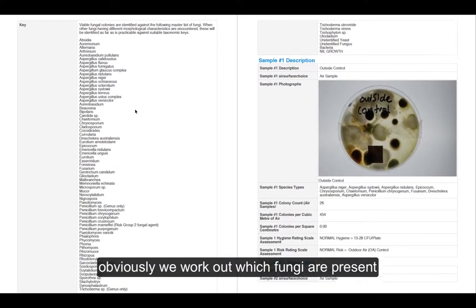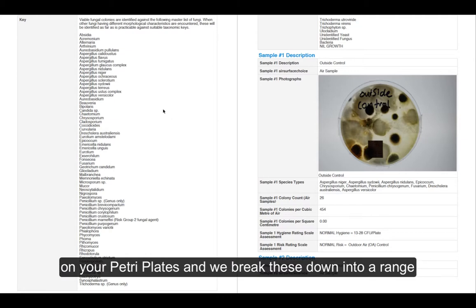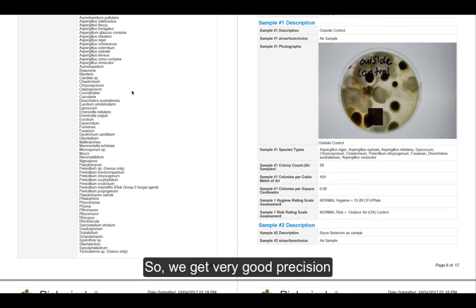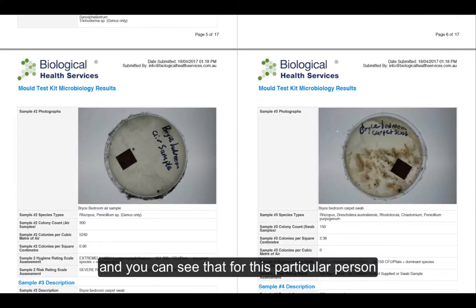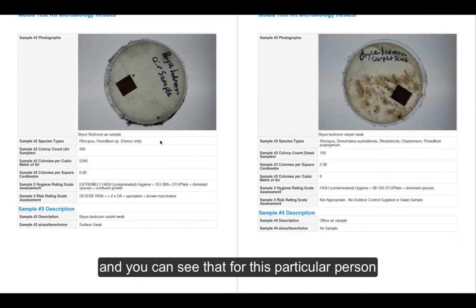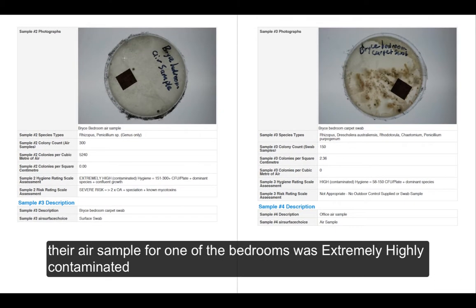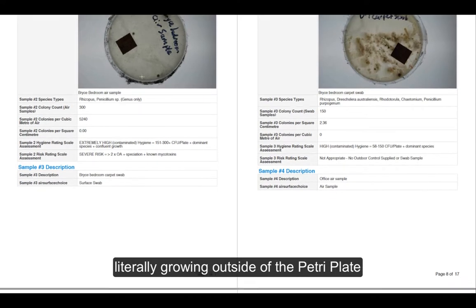We work out which fungi are present on your petri plates, and we break these down into a range of different fungal genus and species classifications. So we get very good precision, and you can see that for this particular person, their air sample from one of the bedrooms was extremely highly contaminated. You can see all of these spores literally growing outside of the petri plate.